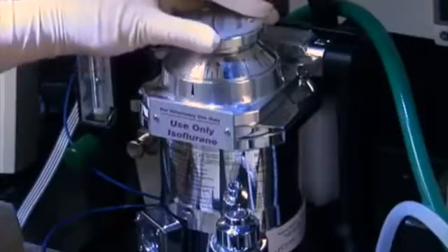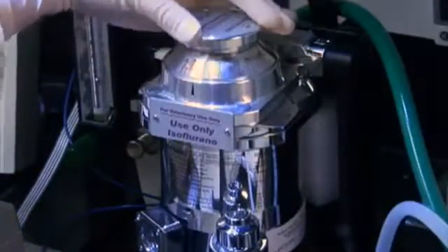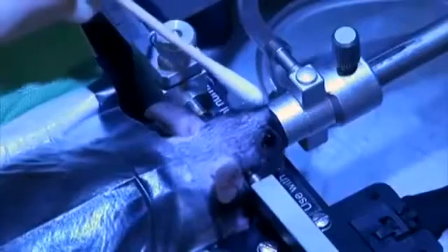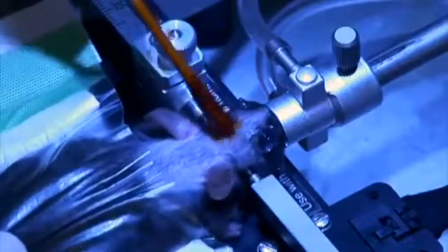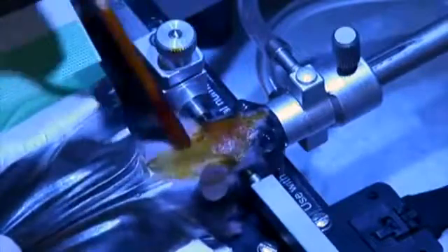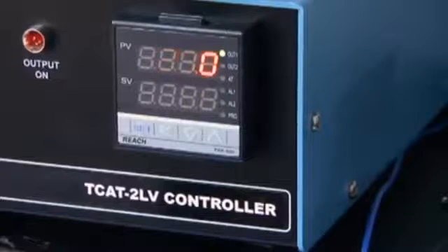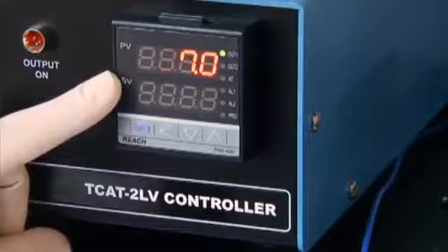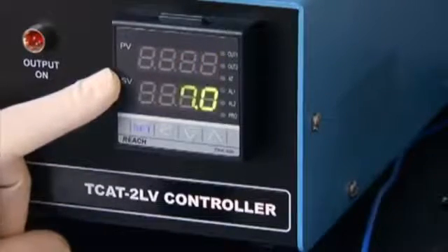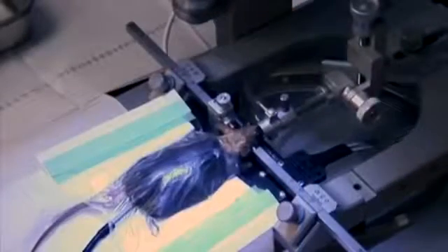Turn the isoflurane level down to 2% for maintenance of anesthesia. Dab eye ointment onto each eye. Wipe the top of the head and neck with a cotton swab dipped in 95% ethanol followed by a cotton swab dipped in iodine to sterilize the surgical area. Also, place a sterile drape over the mouse.